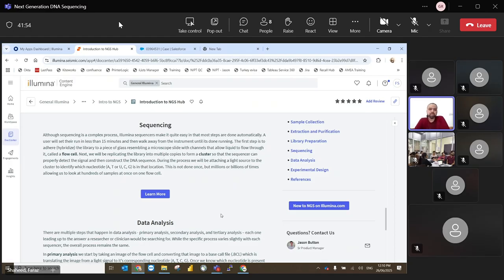Next generation sequencing, especially for Illumina, is actually sequencing by synthesis. So it still uses the fluorescent labeled dyes, but it does not use the ddNTP, it uses normal dNTP. And after addition of each base, the fluorescent signal is captured and different fluorescence is given by different bases.